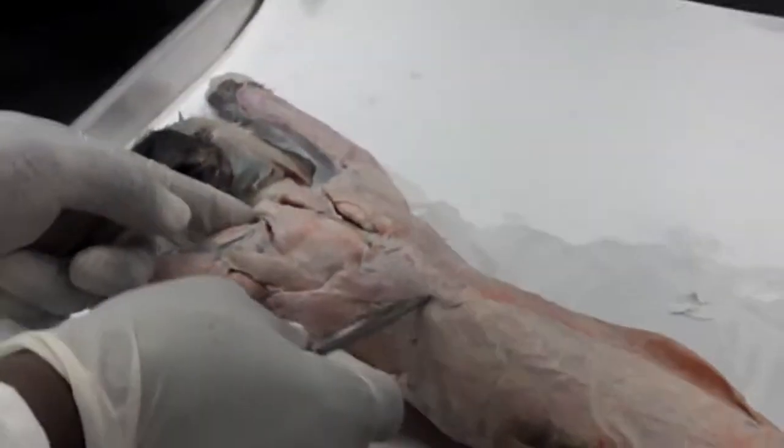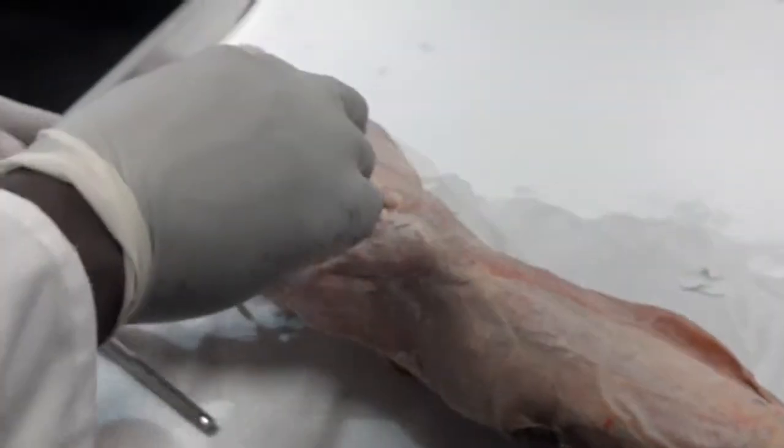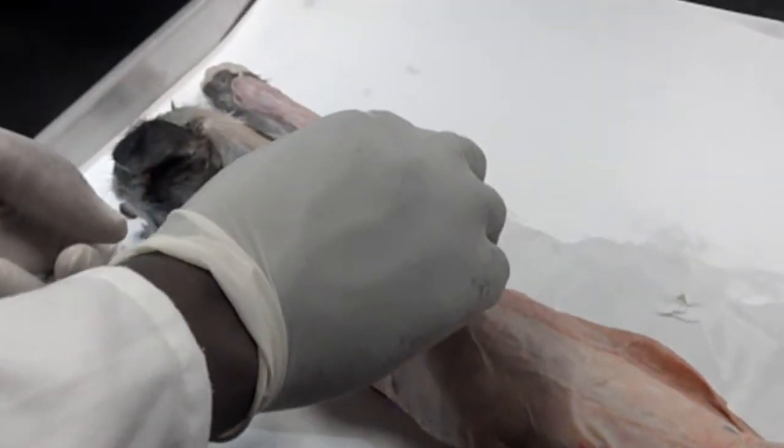Now, all these back muscles, they are trapezius group. Okay? The one around the neck is the clavotrapezius. Covering the scapula, you have acromiotrapezius. And then below that, we have spinotrapezius.